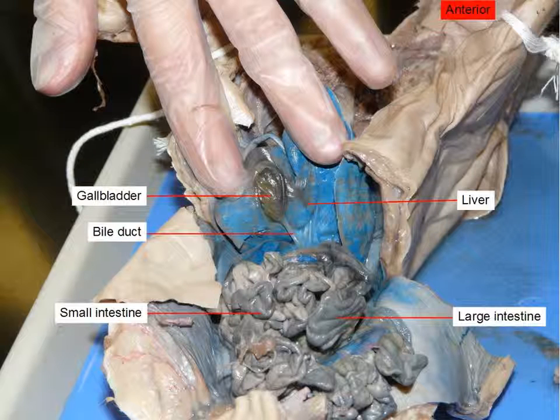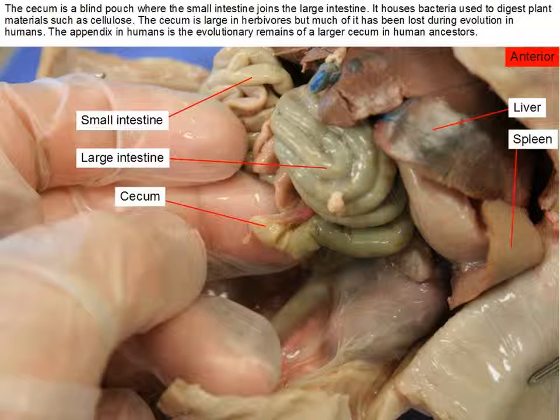Again, nice picture of gallbladder. Do note that your pigs are injected with dyes. Ideally, there'll be blue veins, red arteries. However, this doesn't always work perfectly, so don't consider it a hard and fast rule. I have to look up cecum for you. I think it's the place where we store bacteria like we store in our appendix. Don't forget the spleen that kind of peels off on the side here. It's typically pinkish.